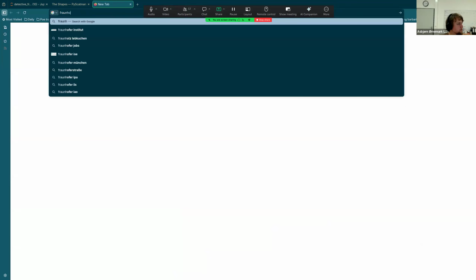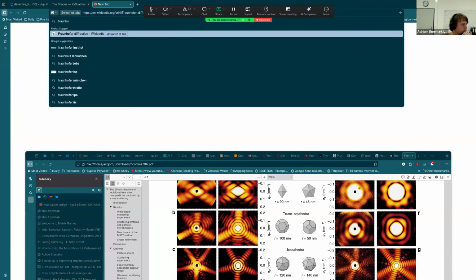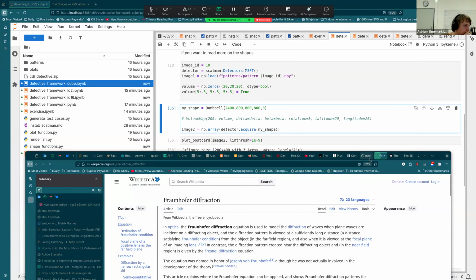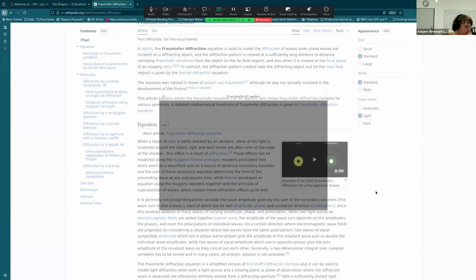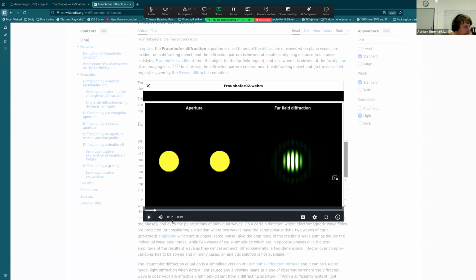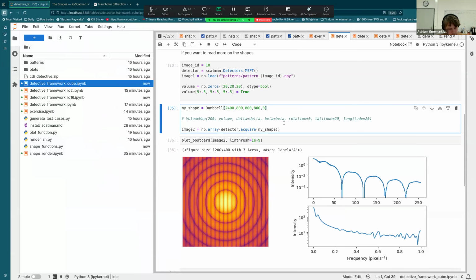I think it was exactly that. We'll just quickly do that rotation to 90, because I think the way this is going, it's going through the dumbbell in this direction.